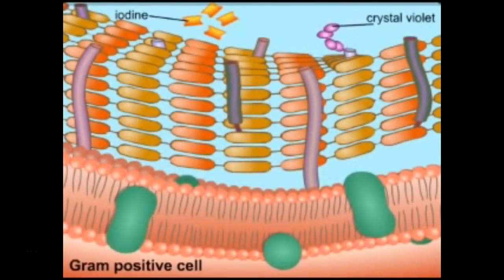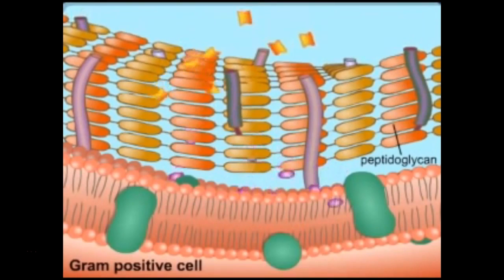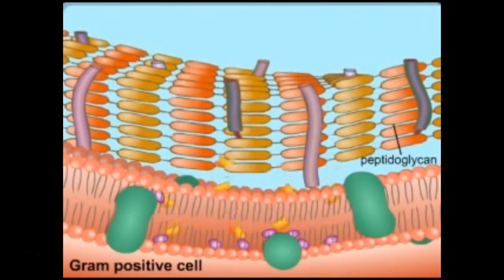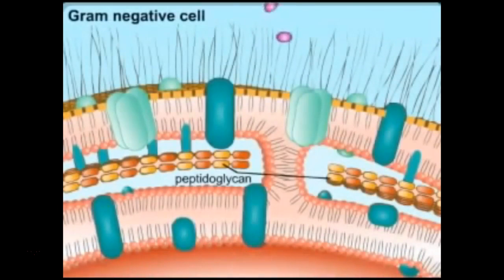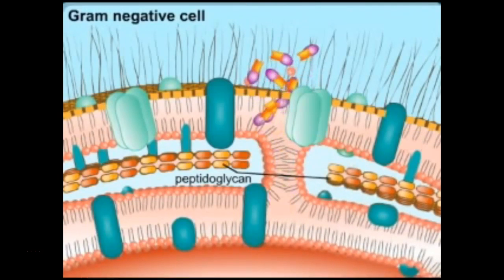Generally, the gram stain correlates with the cell wall structure among the bacteria. The ethanol is thought to shrink the thick peptidoglycan in gram-positive cells, thus retaining the dye. The thick dehydrated peptidoglycan layer of gram-positive bacteria appears to be a permeability barrier, preventing the loss of the crystal violet iodine complex. In contrast, the peptidoglycan in gram-negative bacteria is very thin and has large pores. Ethanol may extract lipids and increase the porosity, thus removing the crystal violet iodine complex.